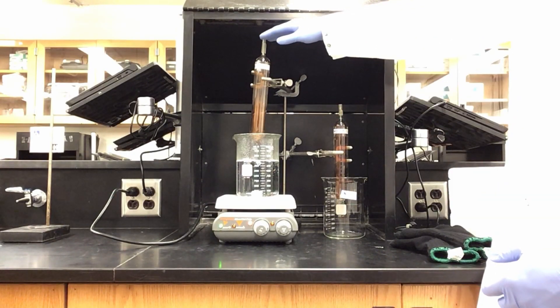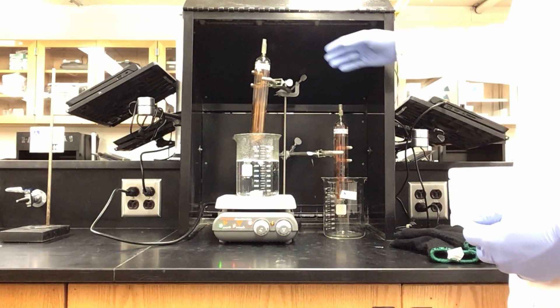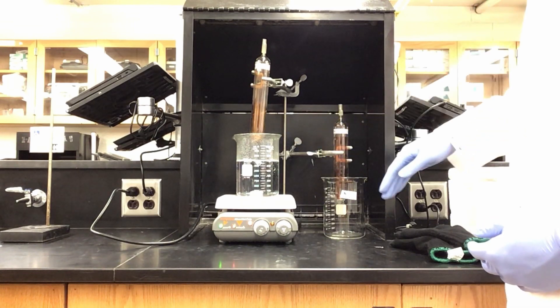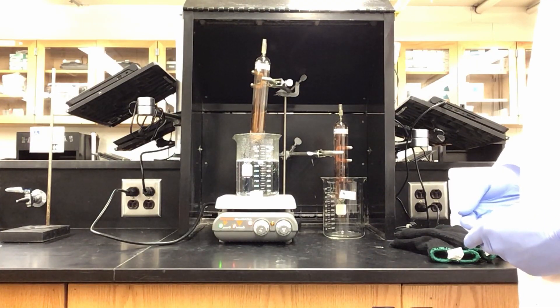Here we have two tubes containing the equilibrium of N2O4 and NO2 gas. We are going to be taking these tubes and lowering one into a hot water bath and the other into a beaker filled with dry ice. When I do this, it will show the shift in equilibrium.